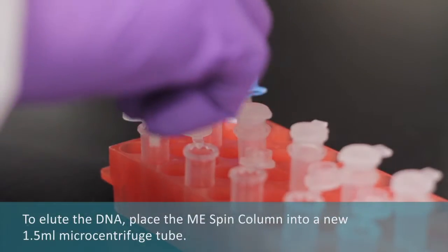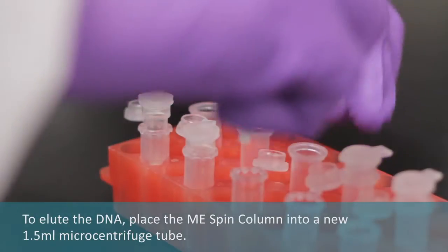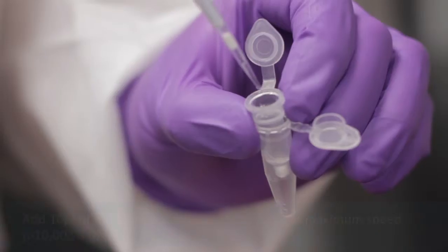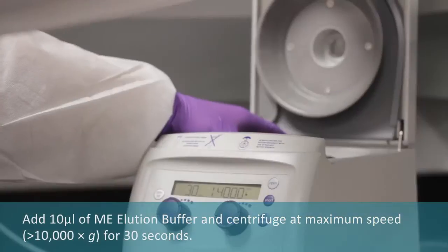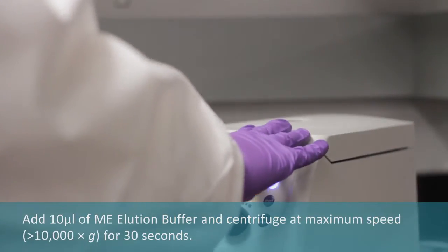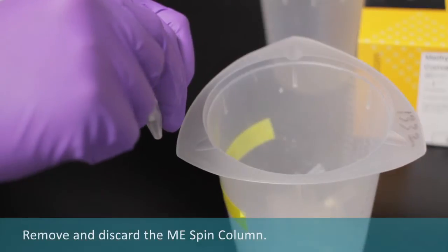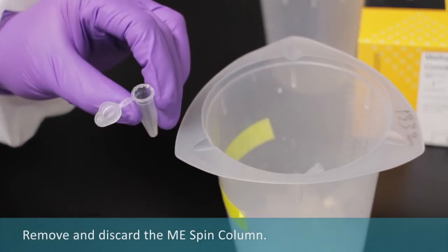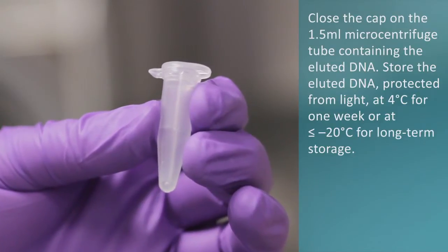To elute the DNA, place the ME spin column into a new 1.5 mL microcentrifuge tube. Add 10 µl of ME elution buffer. Centrifuge at maximum speed for 30 seconds. Remove and discard the ME spin column. Close the cap on the microcentrifuge tube containing the eluted DNA.